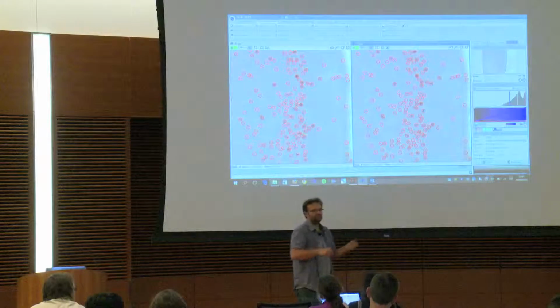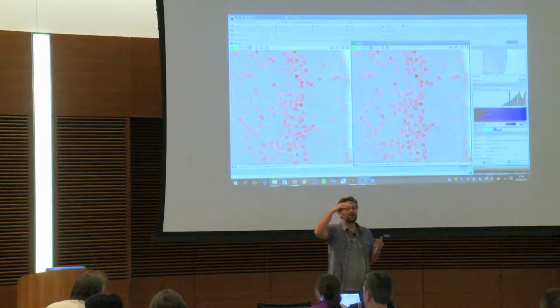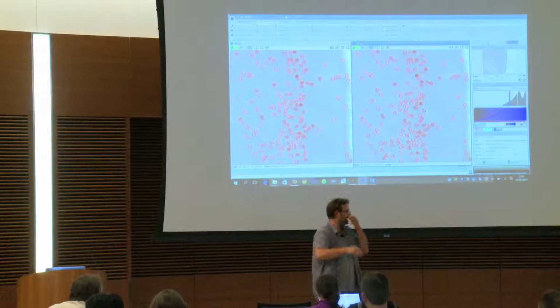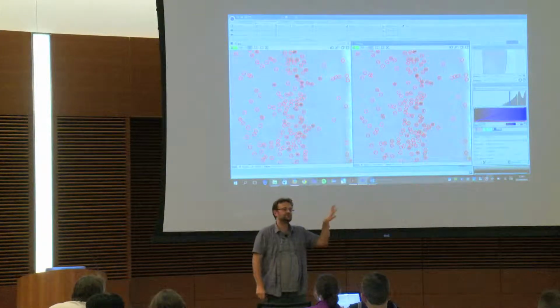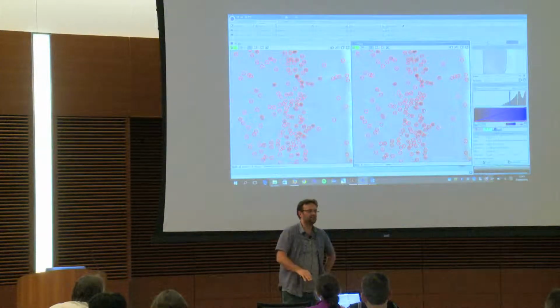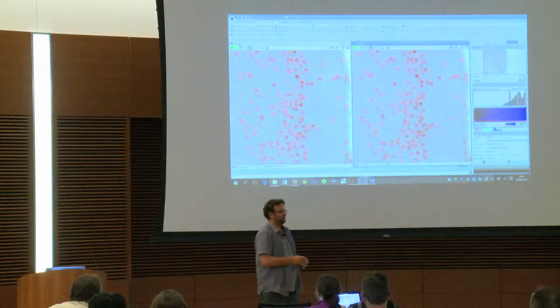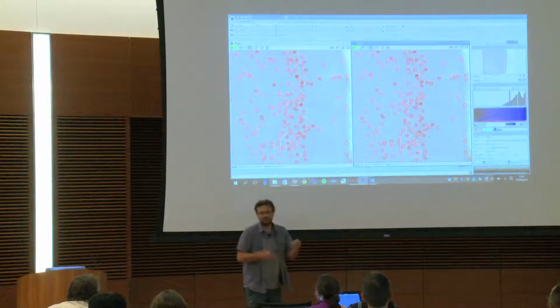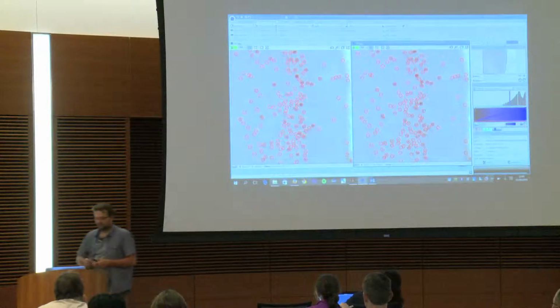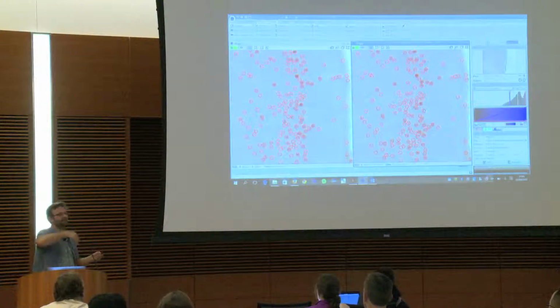So before, this plugin was editable. So you were able to change a spot to say, I don't want this one, I want another one. And you see, it's less than a second to detect everything. And the biologist came back to me, and told me, okay, I'm very tired. I spent 8 hours on your system for 1 image. And I still have not the good results. So I said, okay, you are very interesting, and I will track what you do. So I keep a record of everything that she deleted and I did.